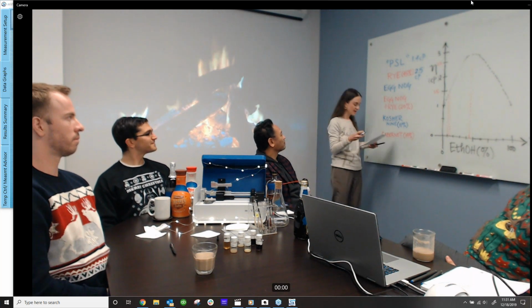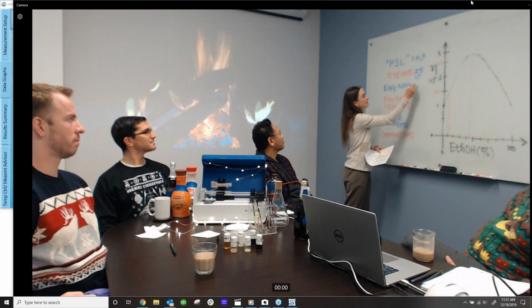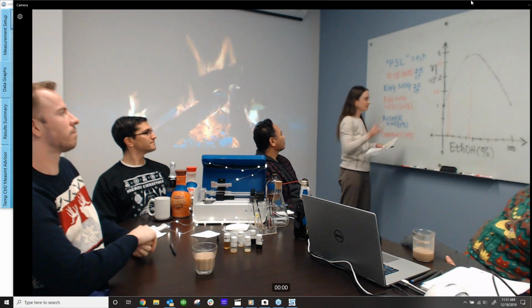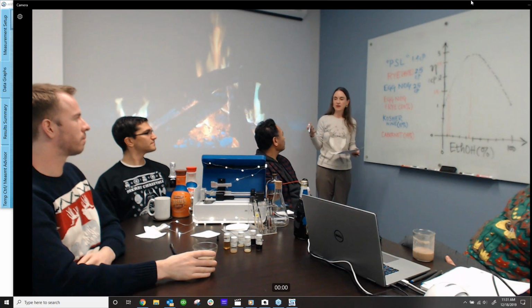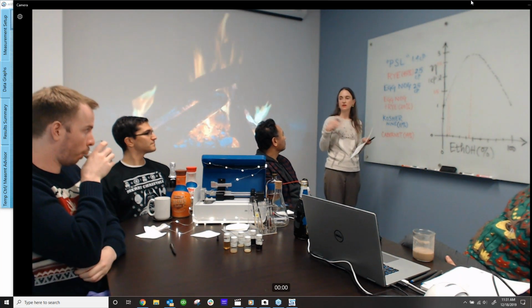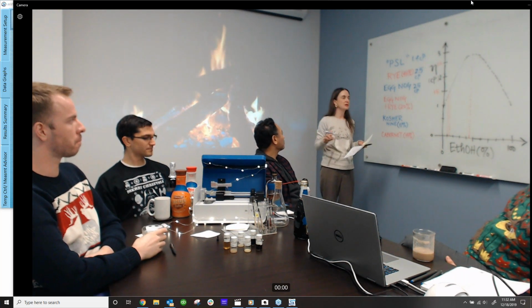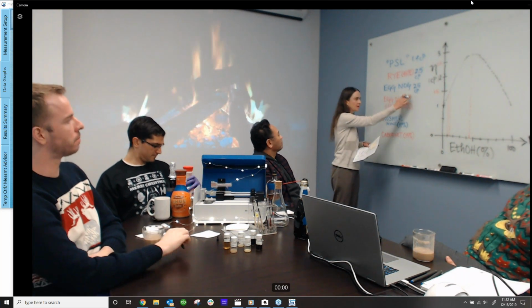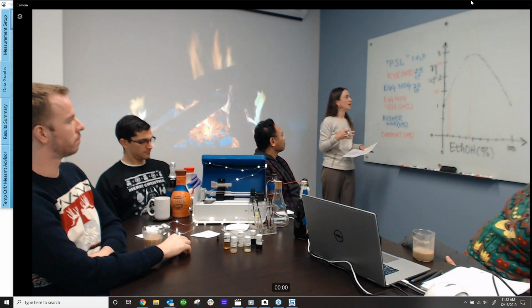Now the eggnog, when we measured the eggnog, this too was coming out at about 2.5 centipoise. Again, the eggnog, although predominantly water-based, does have some fats, some proteins, and the added thickeners, the locust bean gum, gellan gum, if you look at the ingredient list. So this seems like a reasonable number. We can't really say too much more than that at this point.